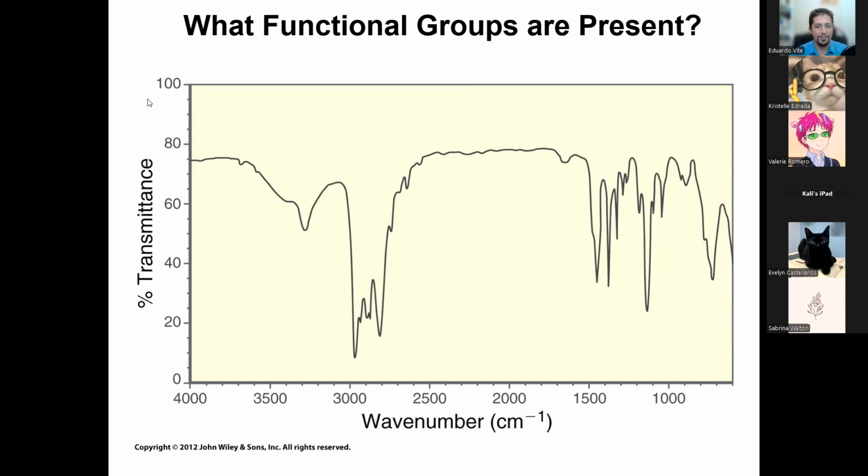Amine NH. So why is it an amine? One weak peak, roughly between 3200 and 3500. A very weak peak to the left of the stalagmites. That's usually where we expect to find amines. And so, yep, you see it right there. This is simply just NH by itself.